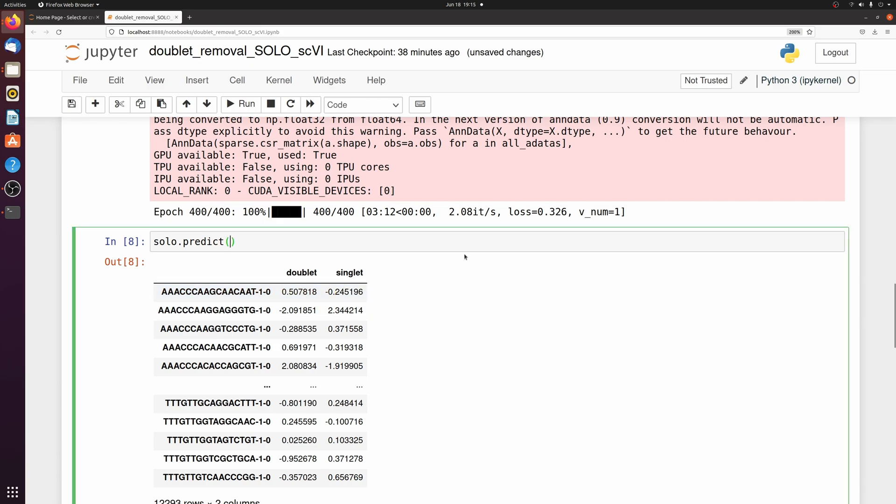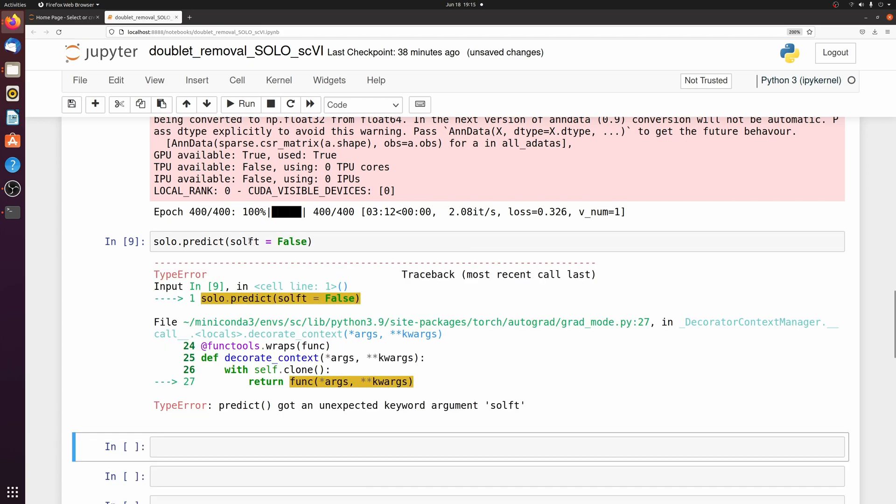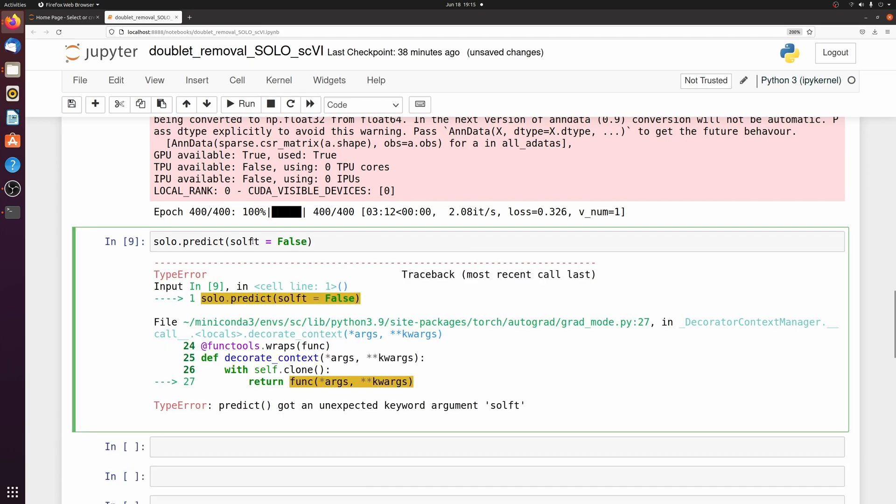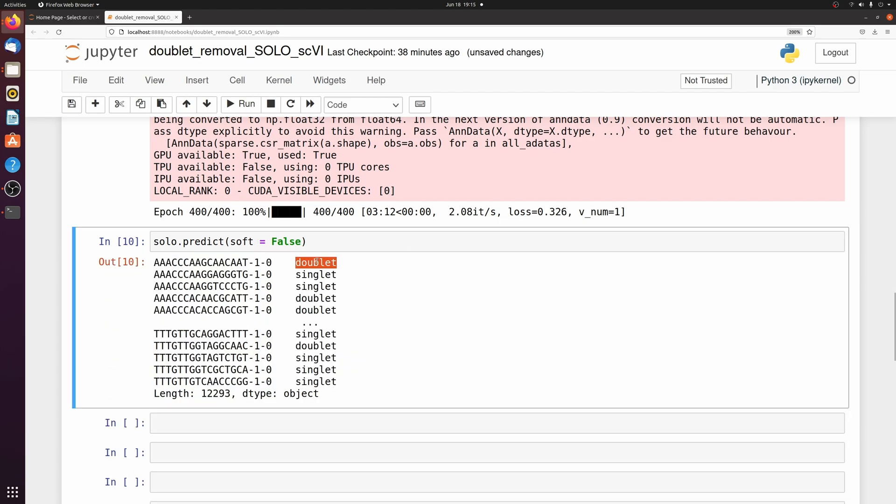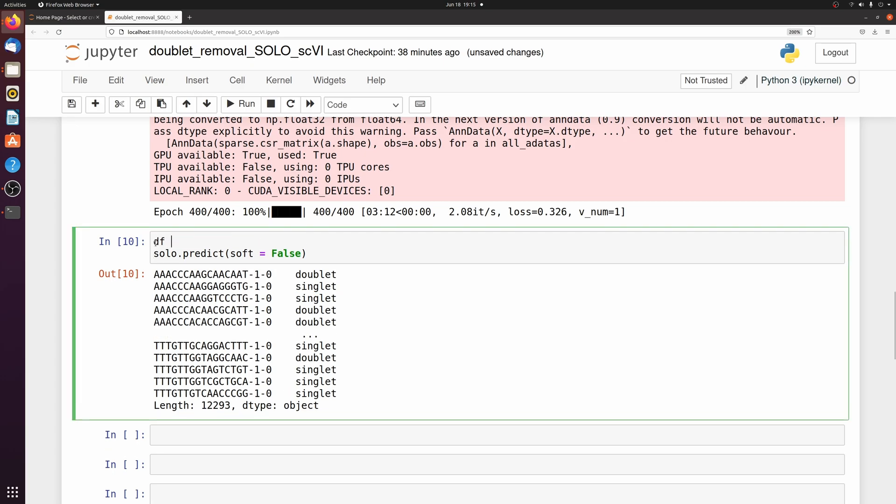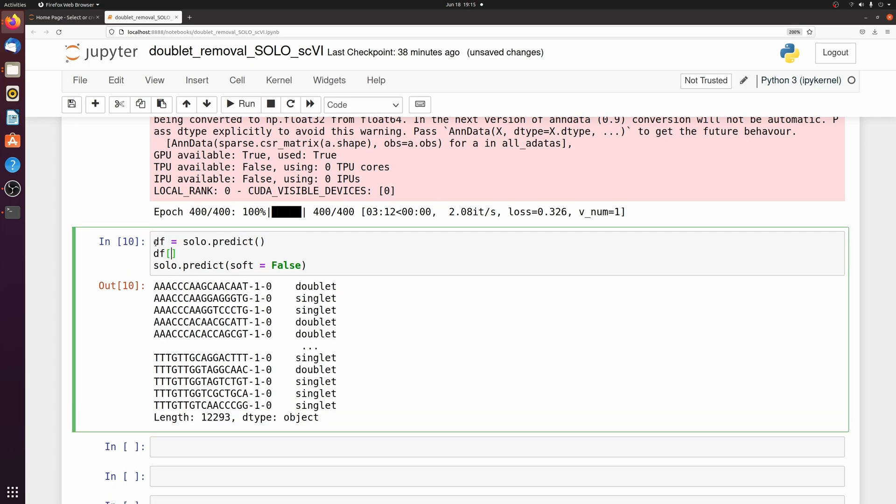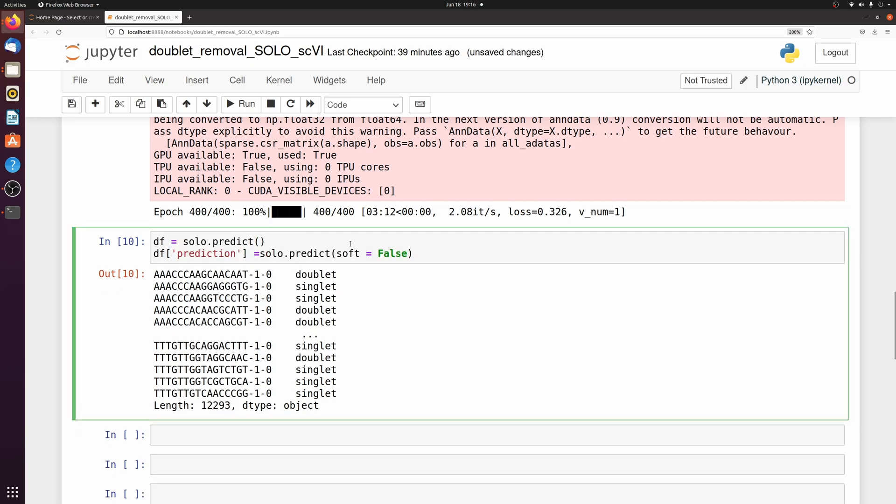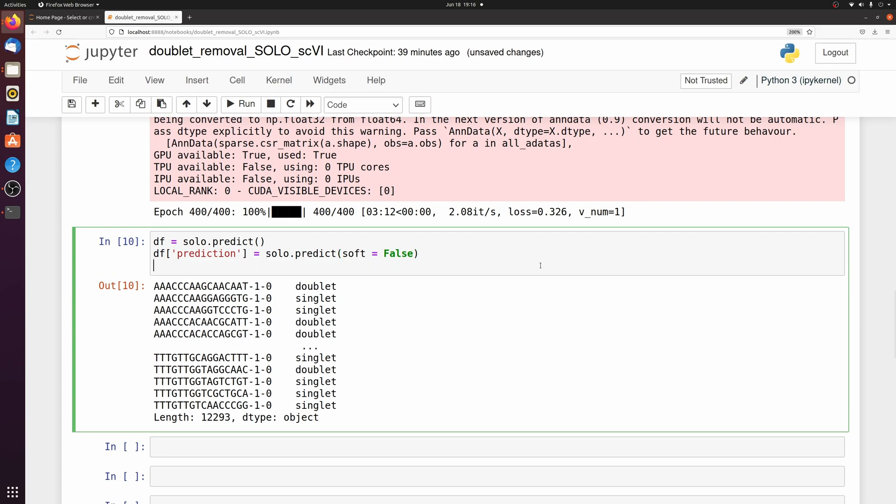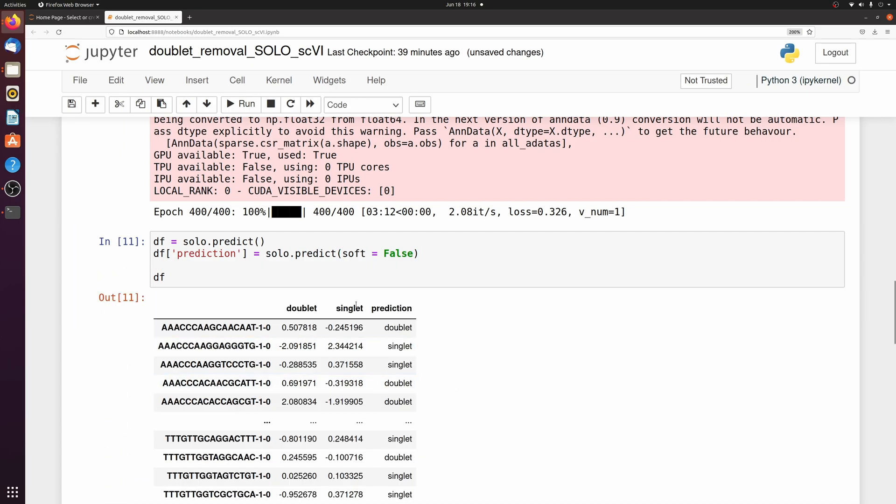So if we actually pass soft equals false, it returns the predicted value. So let's just make a little dataframe with this.